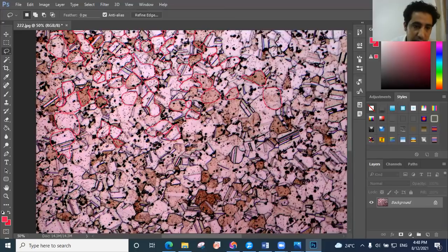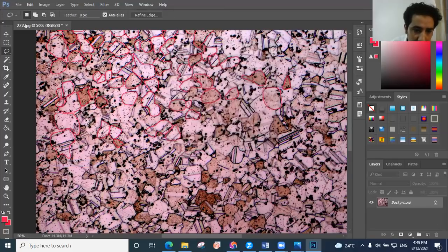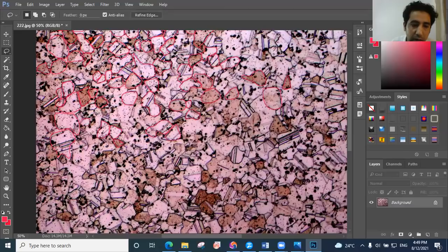We already covered this side and have here one clear. And you can just also move to find clear grains around.